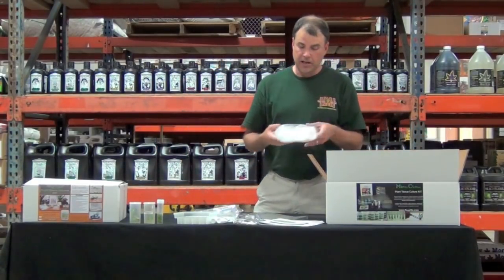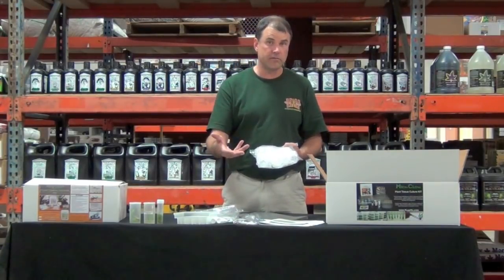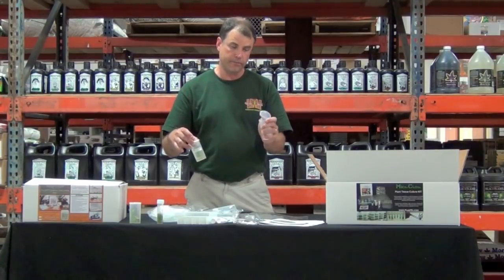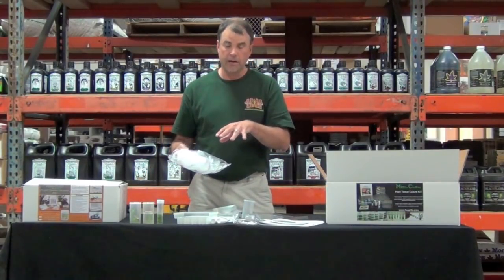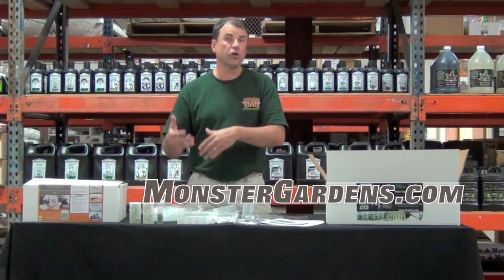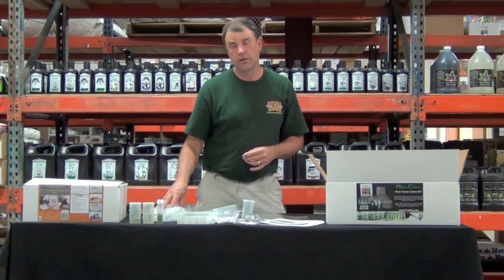Your kit is also going to have a bag of 30 baby food jar lids — polypropylene lids that snap onto ordinary glass baby food jars. Baby food jars are the same everywhere in the world, which is nice because this kit is sold and purchased everywhere in the world. The kit as prepared comes with flip top vials — very handy because you can just open with your thumb and close. At the end of 25 or 30 days you're going to want to move those plants into fresh vessels, trim them of any extraneous material and yellow leaves, and move them into new bottles. Tissue culture is always about moving the plant into fresh medium.